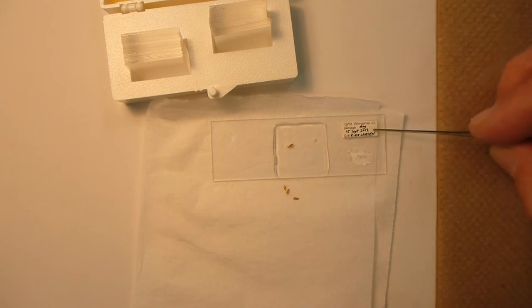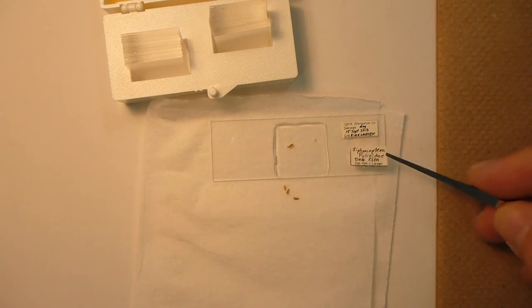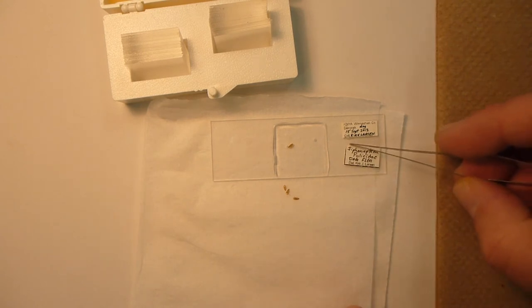And then we're simply going to glue our locality label in position. You make sure that you've already got it filled out. And then the same thing with your determination label, exactly what it is. So this happens to be a dog flea that was collected here in Decora off of my dog.